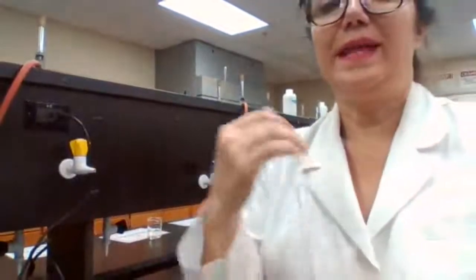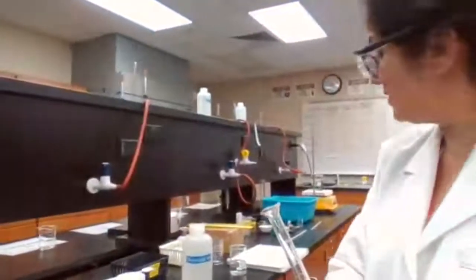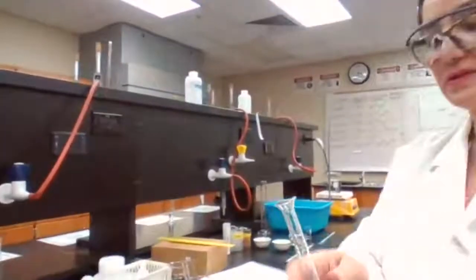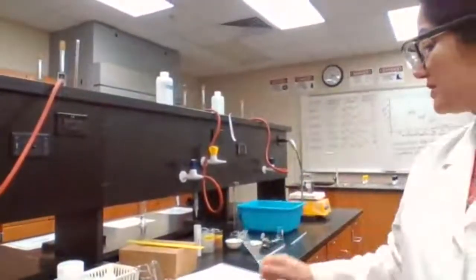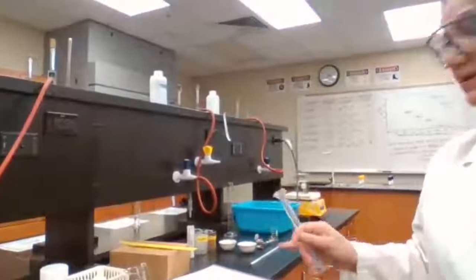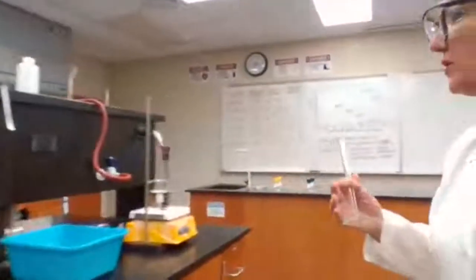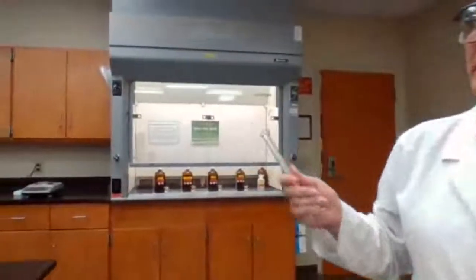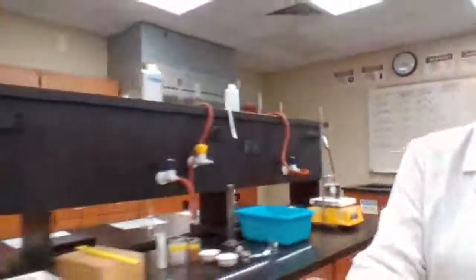Okay, the next step in the procedure is asking to measure the density of an unknown liquid. So we already have the mass for the graduated cylinder. We're going to put in the unknown liquid. I'm just going to pick one unknown liquid. We keep the unknown liquids inside the fume hood, so it's not there. Let's look for the unknown liquid.